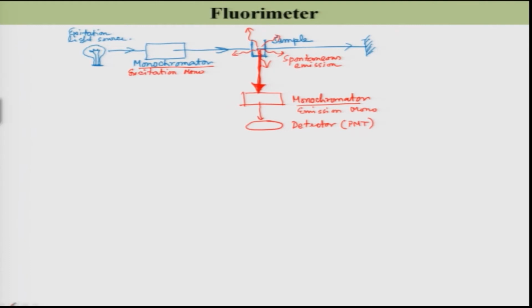If you use a particular light to excite the system over here, let us say the light you used is lambda Ex, for exciting this sample, then what I am going to do is scan the lambda emission and plot the intensity versus lambda emission. So, I will make a plot over here, like this, lambda emission. Whatever lambda emission you want will be selected over here. You choose whatever you want.